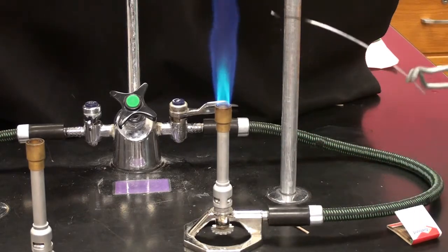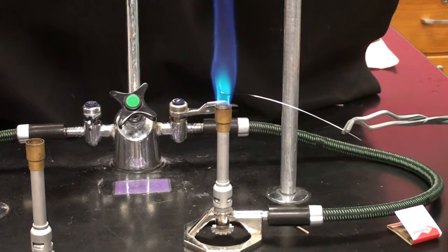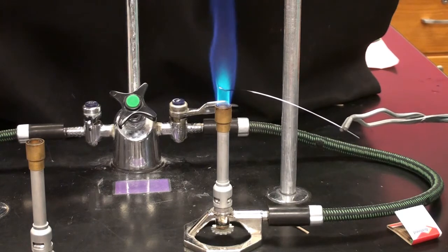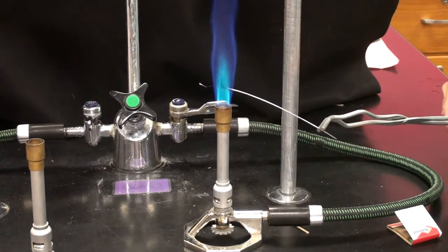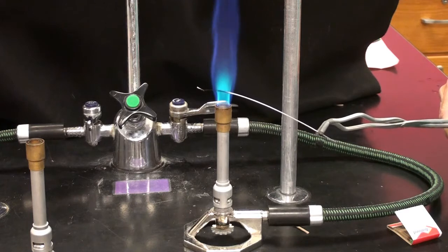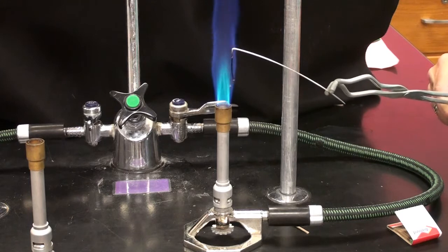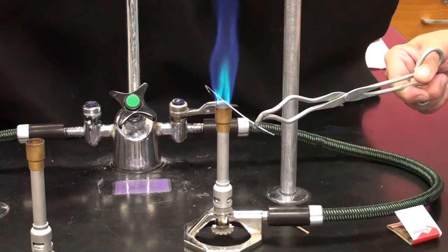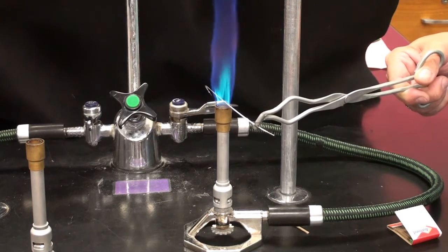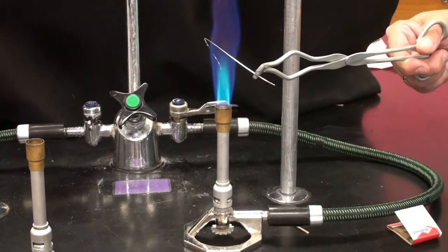So here I've got aluminum, and down here in the cool part, remember this is the area where the screen did not glow, and I don't see much happening to this aluminum wire. If I bring it up to the hot part above, oh, look at that. It took almost no time to melt that aluminum wire. So down here at the lower part of the flame, this is not as hot, and the part above it is hotter than what it takes to melt aluminum. Bring it up again. There we go.